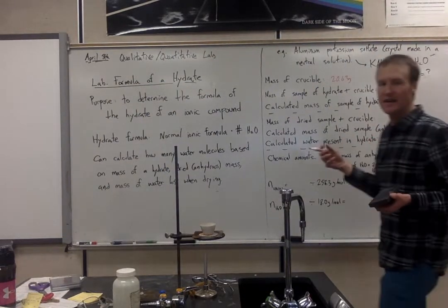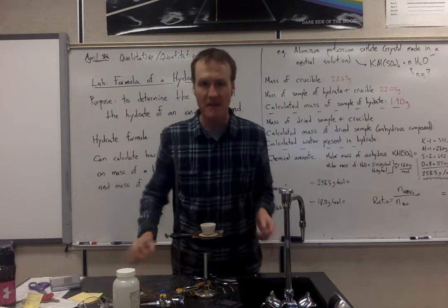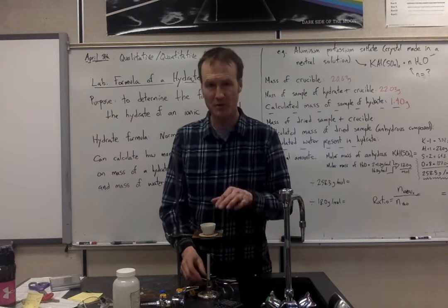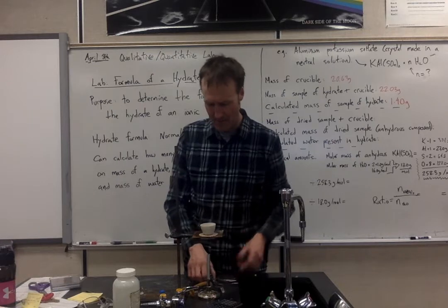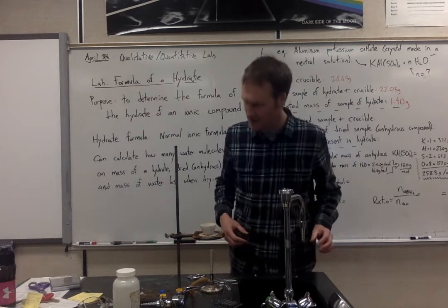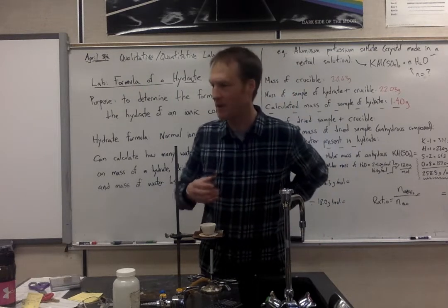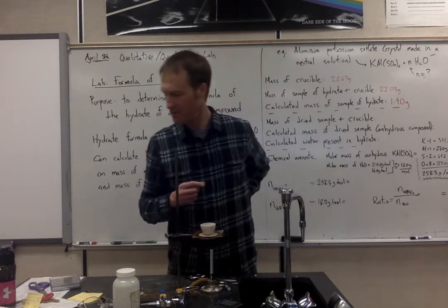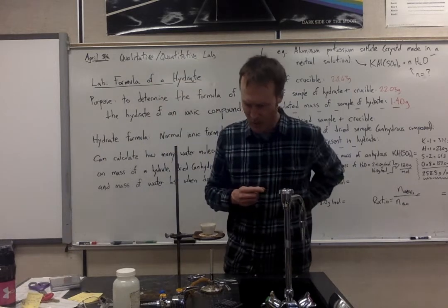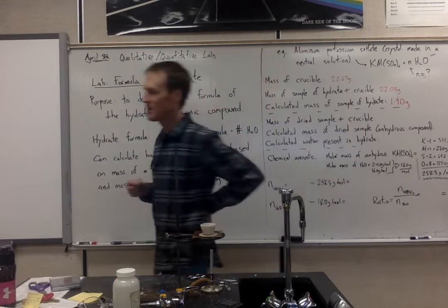What I did then is I took that hydrate salt and I put it in the crucible and I heated it up. In fact, it's still in here. What I'm going to do is start the Bunsen burner up again because I want to make sure this is as dry as possible. The better you are at getting the water out of there, the more likely you are to get a good result.